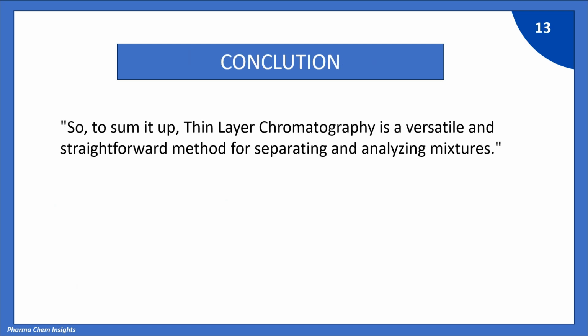Conclusion. So, to sum it up, thin layer chromatography is a versatile and straightforward method for separating and analyzing mixtures.